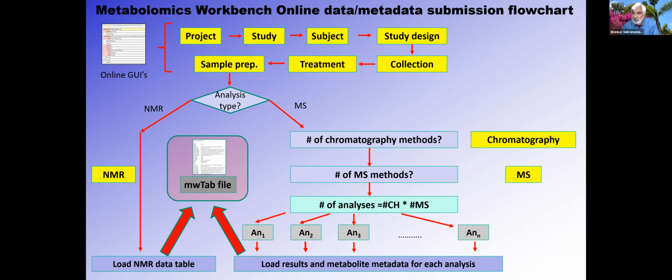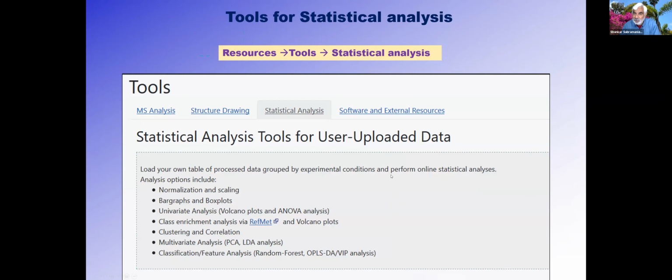Then you'll be able to analyze the data using these factors. The Metabolomics Workbench is 70% lipids data, because most metabolites that are measured are lipids. There are many statistical tools for analysis. I'm going to walk you briefly through the basis of these tools and some examples of these tools.